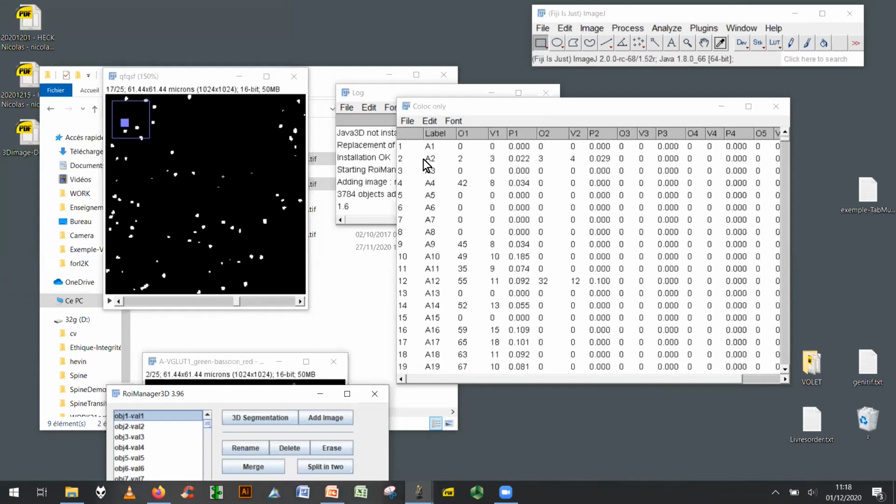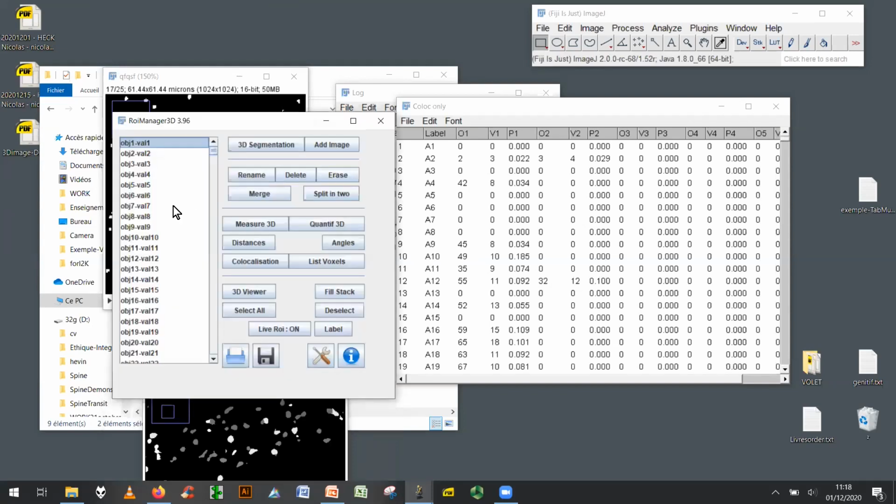And so the object number 2 on the list is colocalizing with another object. And what you have here is the label of the object, right? So for example, here, the object number 9 is colocalizing with the object number 45. So the number is really the ID of the object. In the second image, it corresponds to the intensity of the object in the image, or the ID, which, okay, 9 is this one, of course. And it got the value 9 in intensity in the image.